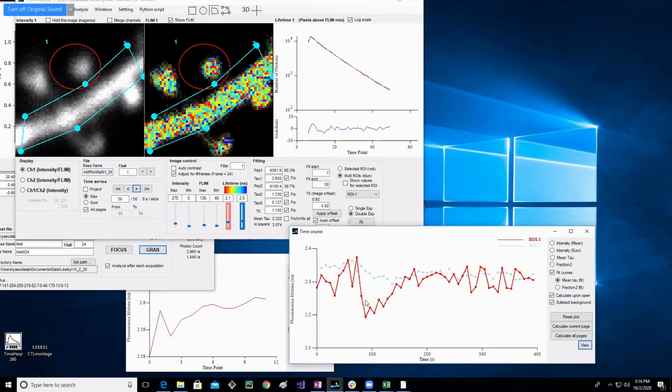Just like what I was saying, it's about having a good number of photons, having a stable baseline, and having a baseline that's long enough to know that it's stable. Typically you do about 1/3 of your total experiment time or so. Again, your mentor will be able to give you specifics for the experiments you're doing.